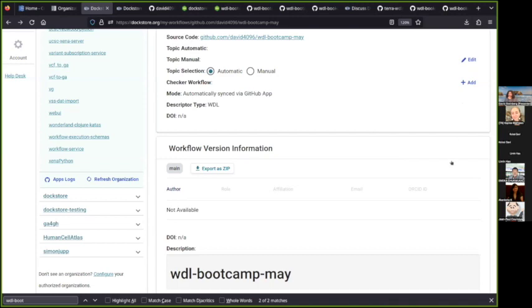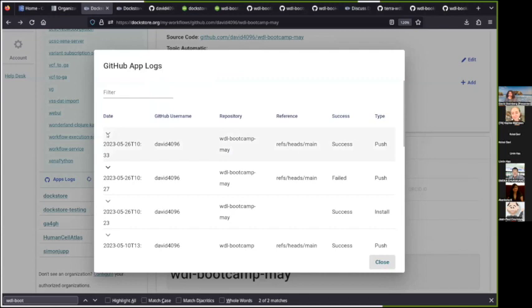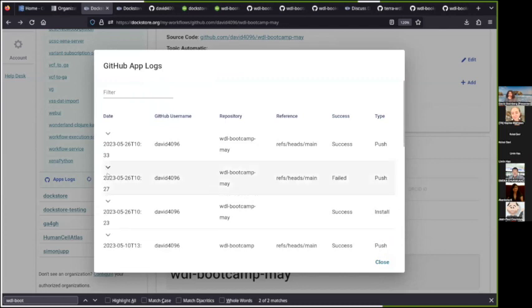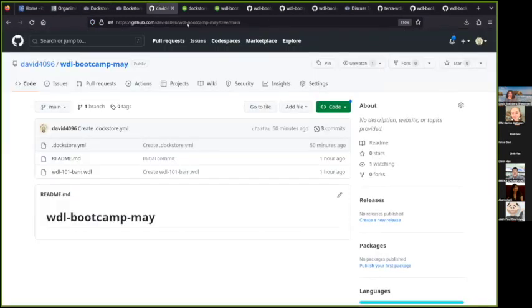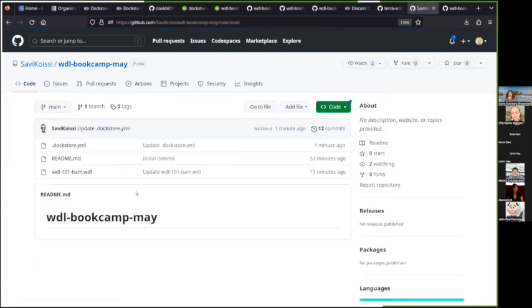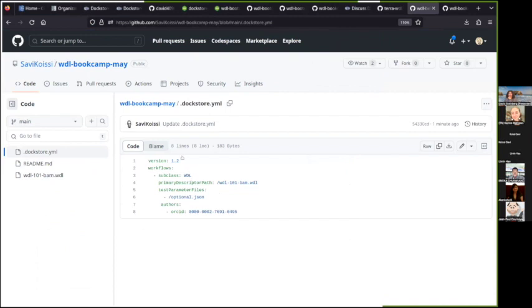It's still showing me that it failed. I don't know why. Okay, so you pulled up the apps logs. Then click the failed entry and it'll give you a little pull down, and then just paste here what it showed. It is still returning the same error. Okay, let's look at this again. Where is this? No, hang on. This is not the error. The error is this one. Oh, good, a new error.